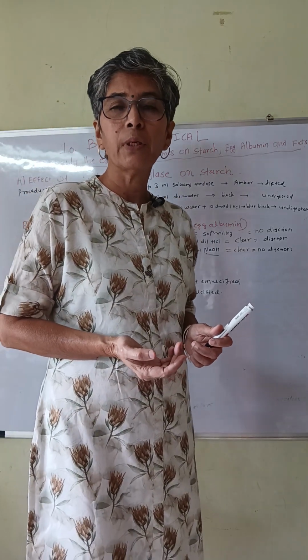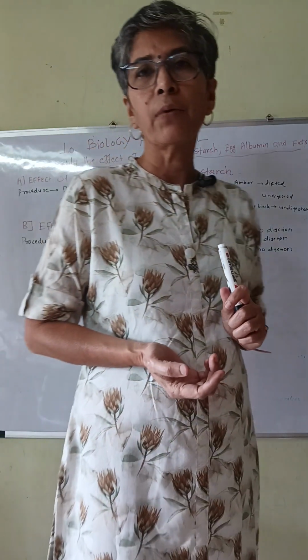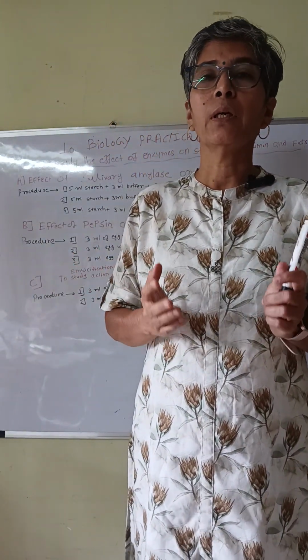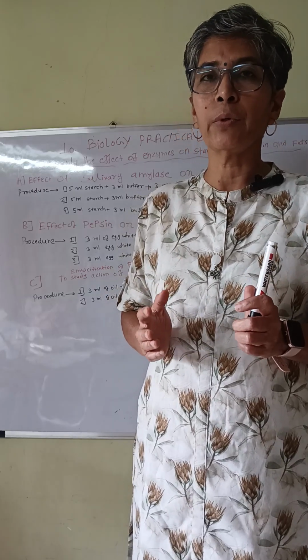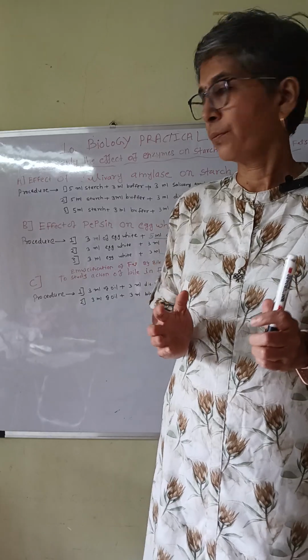Okay, this is our aim of the experiment, and the requirements for this procedure as usual: test tube stand, bile juice, distilled water, dilute HCl, NaOH, etc.